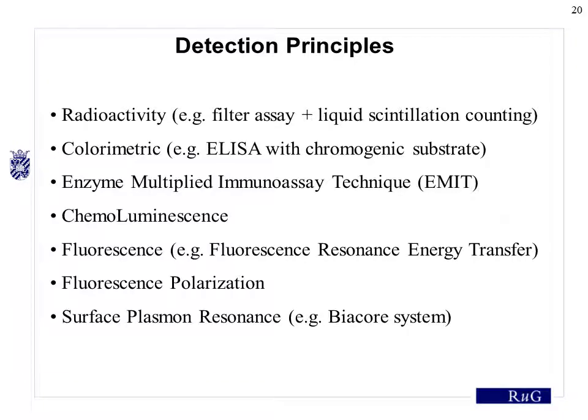A wide range of detection principles have been developed for measuring ligand binding assays, so the interaction between a ligand and an antibody, or a ligand and a receptor. We already heard about radioactivity, which was the classical way of measuring binding of a ligand to a receptor. However, as you may imagine, in recent years there is less and less interest in radioactive ligand binding assays because of the associated risk and also the cost involved with disposing radioactive waste.